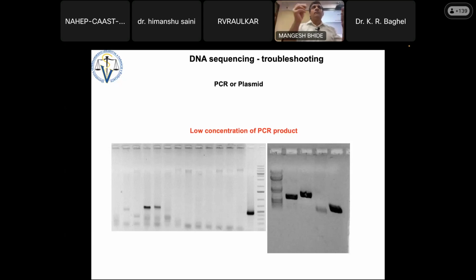And then with the same hands, you start manipulating your DNA, and then it's done. So never manipulate the DNA with bare hands, but always use hand gloves. And there are several other plasticwares that have DNases. So you need to use DNase free plasticware always.